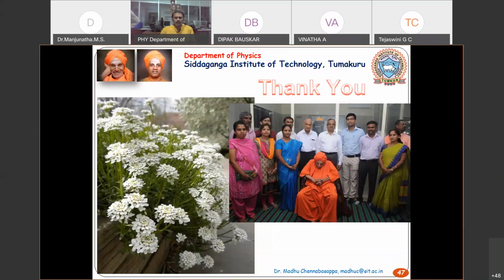Dear friends, as you all know, a lot of research work is going on around the world in searching for functionalized materials with potential applications in science and technology. Before subjecting them to applications, the materials need to be characterized. Among the methods, XRD analysis is one of the best and most versatile tools. With this intention, the physics department has conducted hands-on training on XRD analysis using the available free software.